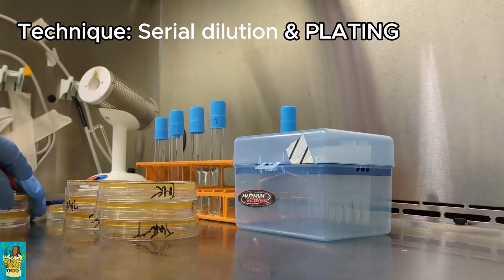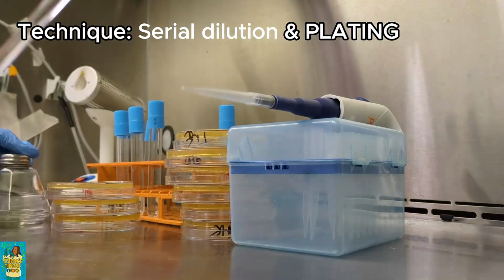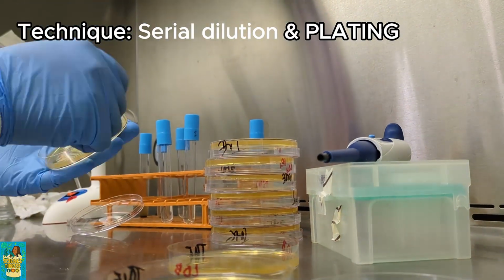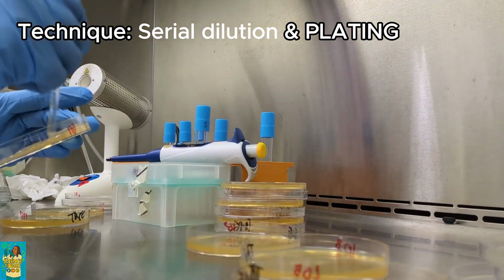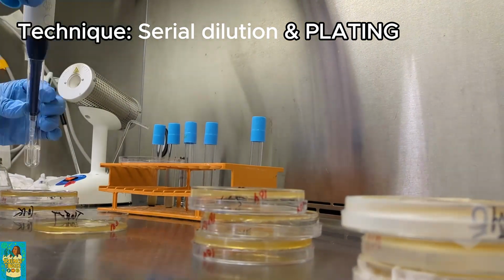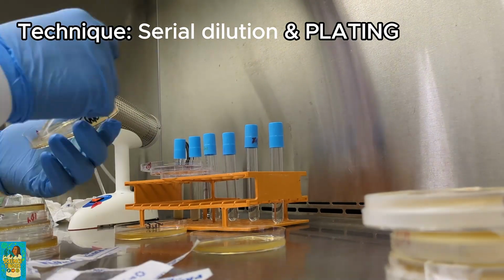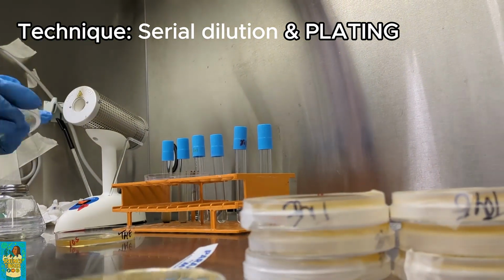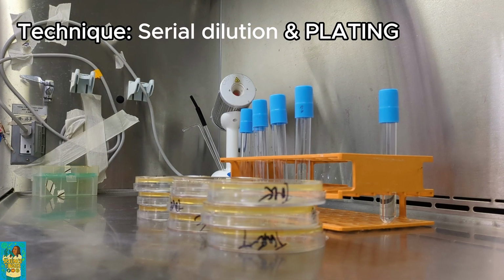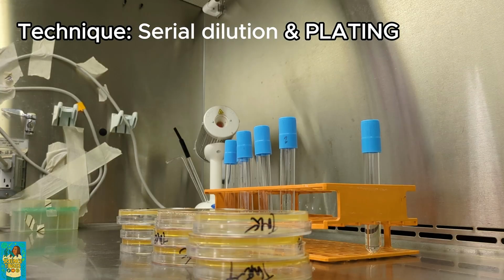Reminder, I already completed the serial dilution part. So I'm going to select the 3 dilutions that I'm going to use, the 10 to the 3, 10 to the 4, and 10 to the 5. I'll take 0.1 ml or 100 microliters from each tube and put them on 3 separate plates. So I should have 9 plates at the end. I'll use a sterile glass rod or hockey stick to spread the liquid from the different dilution series onto the surface of the plates and let them dry, and that is why it's called serial dilution and plating.